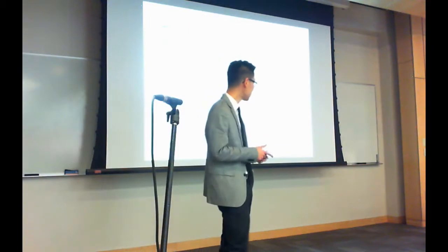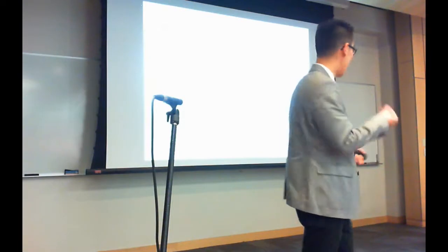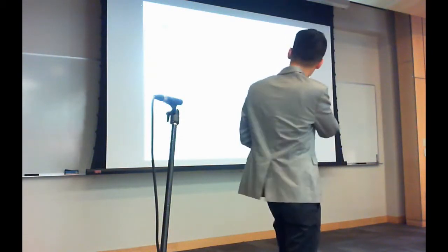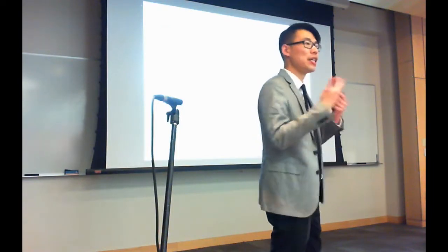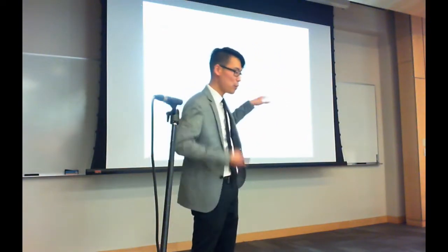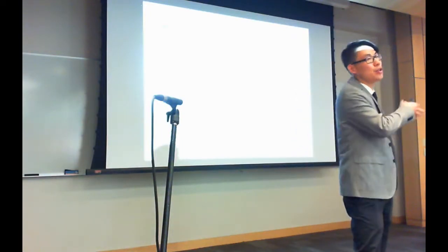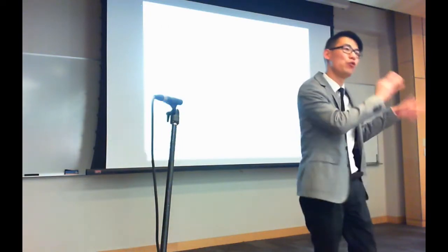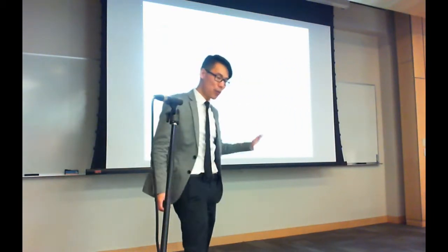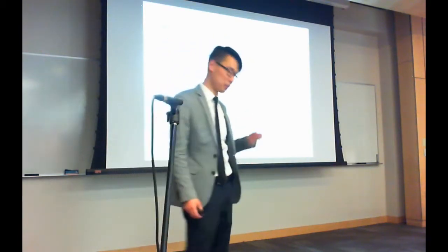And so here we'll talk about how we account for the search space appropriately. How do we have a score that first reflects the quality of a peptide spectrum match? How well is the data explained by a particular spectrum? And how can we work in the confidence of the search space? If it's synthetic, we should trust it more. If it's a full proteome, full cell lysate, we should trust it a little bit less. So what we do here is we borrow a notion from Nitin Gupta, and it's called a database search p-value. And so here's our expression.